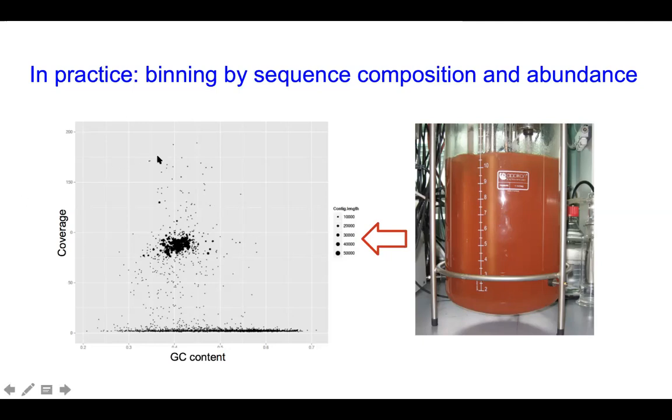These very likely belong to the Anammox genome, but for some reason have a diverging coverage. These things at the top may be duplicated. The ones at the bottom may be mobile genetic elements or some such.